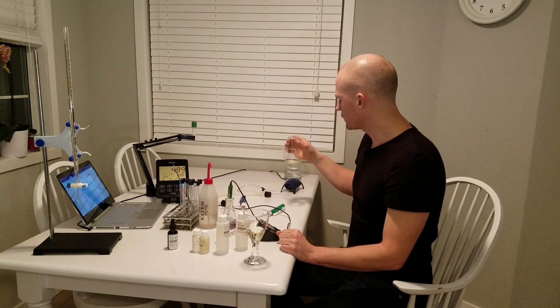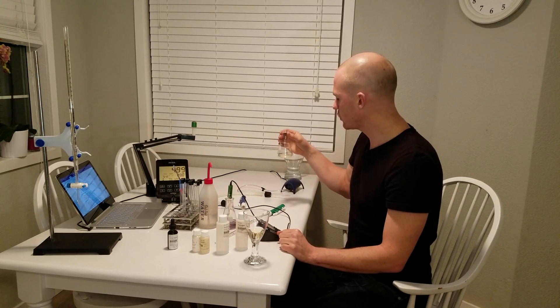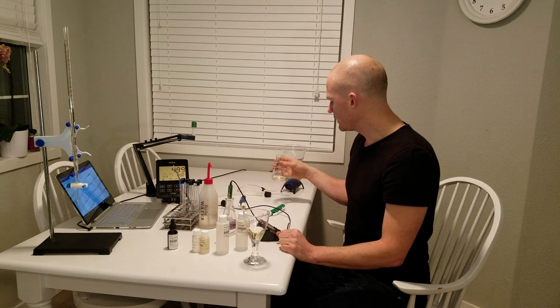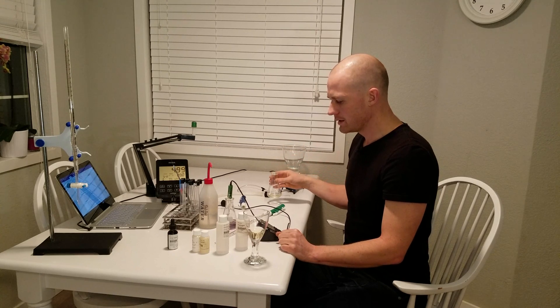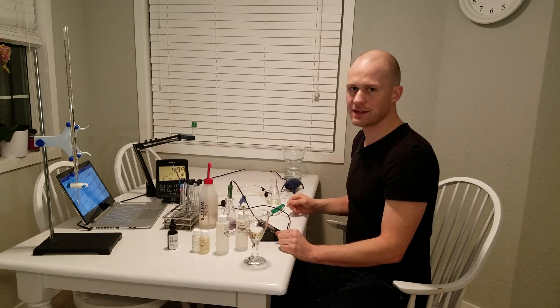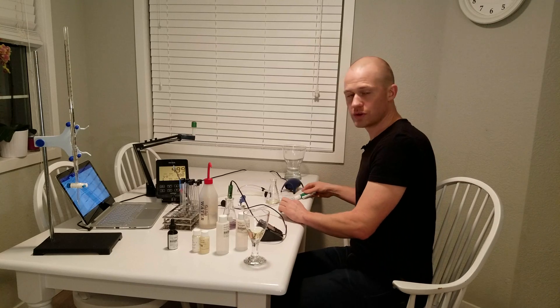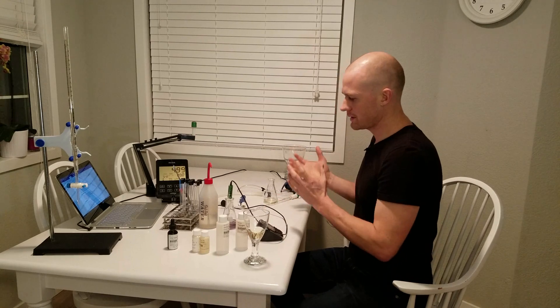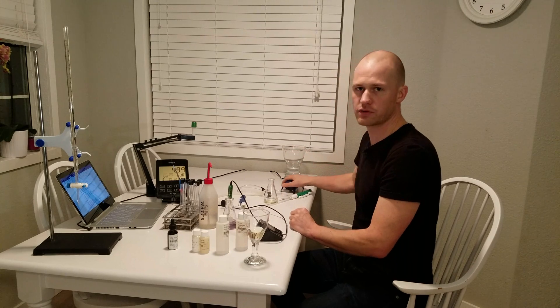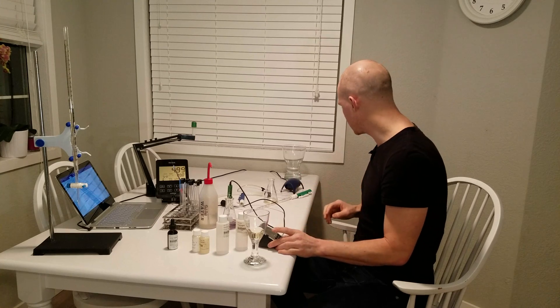Then you start with the other glass. Here you're going to pipette in 20 milliliters of your wine or mead sample. Into that sample we're going to add 10 milliliters of phosphoric acid at 25% strength — it's not very strong. As soon as you do that you'll start releasing the SO2, so you need to cap it right away, then we'll turn on the pump. Let it run for exactly 15 minutes — that's why I have a timer here.